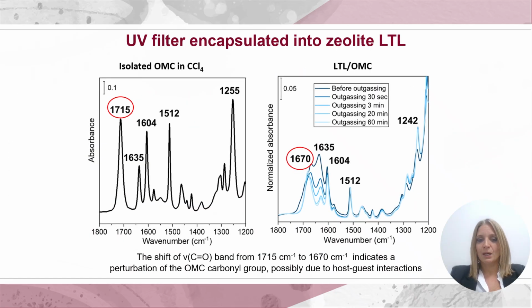We performed infrared spectroscopy first of all. We were able to understand from these results that the molecule was truly encapsulated in the zeolite, because we noticed some shift between the data of the liquid filter and our hybrid materials.